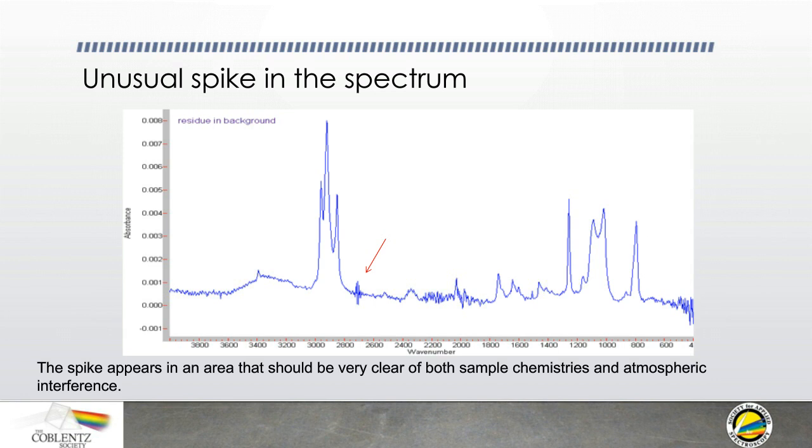So in general, I don't mean the difference between 100 and 100.05. I mean the difference between 100 and 105. If you're seeing those types of things, you've got some sort of an optical problem or a parameter set problem. Because again, if you have an attenuator or a resolution aperture, a J-stop, and they're not set exactly the same for the sample and the background, you're going to see that.